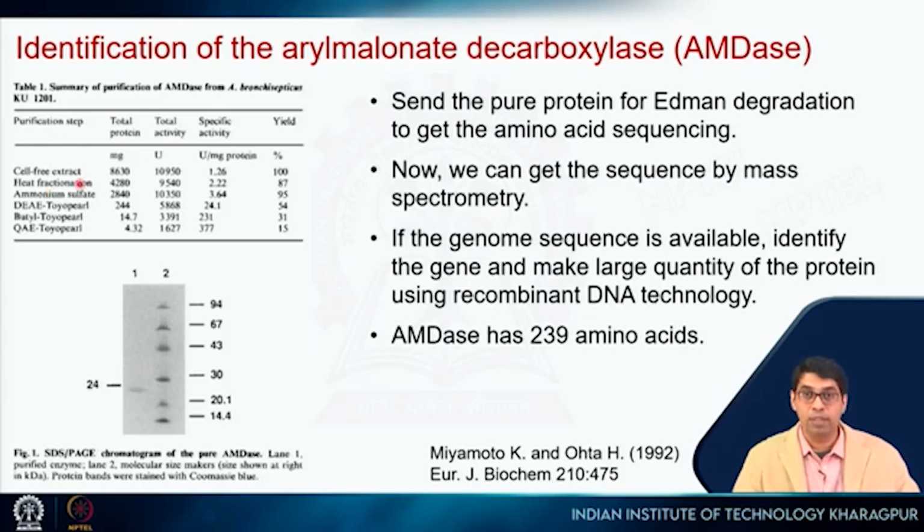They heated their cell lysate, a lot of proteins precipitated, but some stayed in solution, right? So you can see that the amount goes down. Now they took that supernatant, centrifuged it, checked for activity and saw that there is activity. This is good. It means that their protein did not precipitate, right?